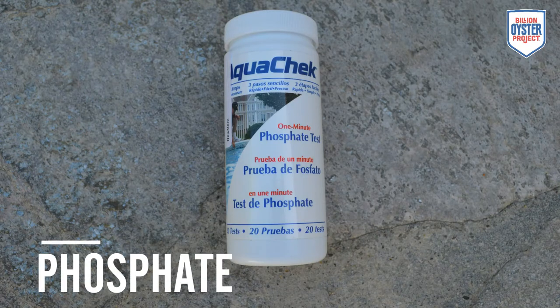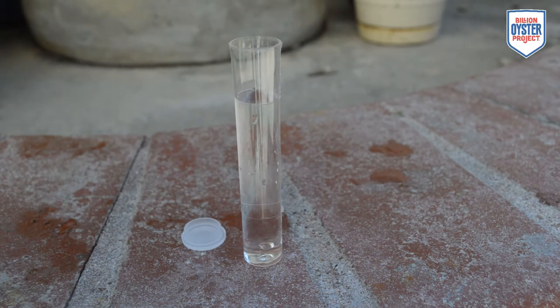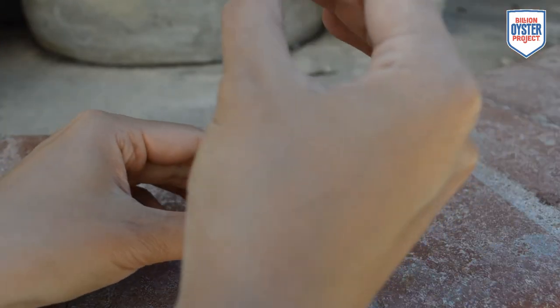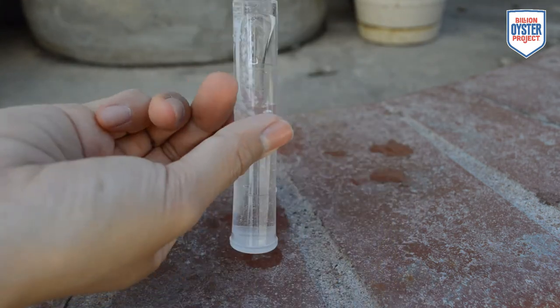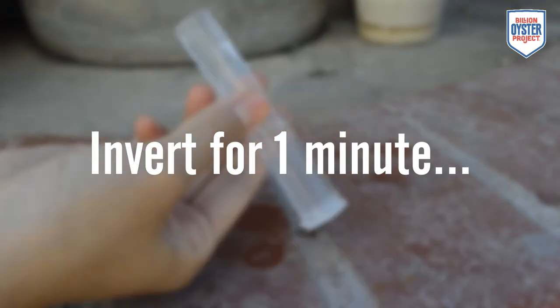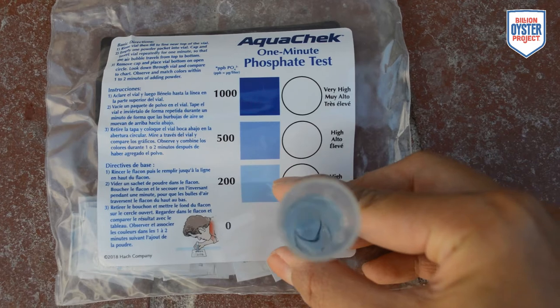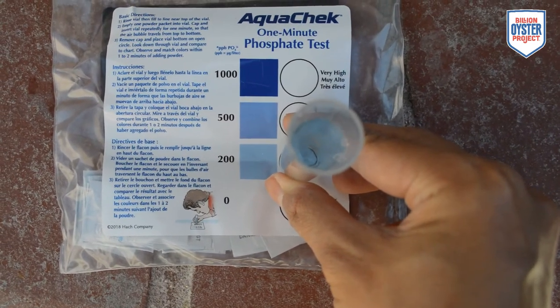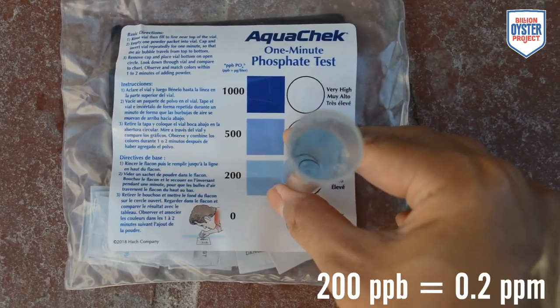To measure phosphate, we will be using AquaCheck 1-Minute Phosphate Test. Fill the provided sample vial to the top line with water. Empty one packet of reagent powder into the vial. Cap and invert the vial for one minute, each time making sure the air bubble travels completely from bottom to top. Remove the cap and place the vial's bottom on the color chart's white circles. Look down through the vial and compare to the chart. Record your result within one to two minutes of adding the powder. Note that this test is in parts per billion and will need to be converted into parts per million.